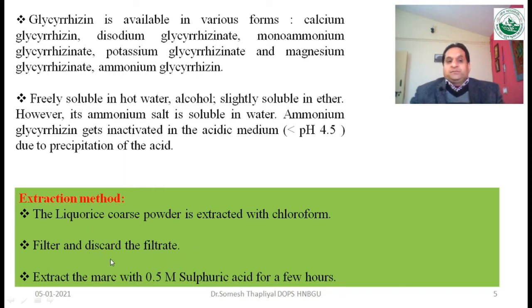Okay, then you will discard the filtrate, and whatever the marc is remaining behind, it should be treated with 0.5 molar sulfuric acid for a few hours.